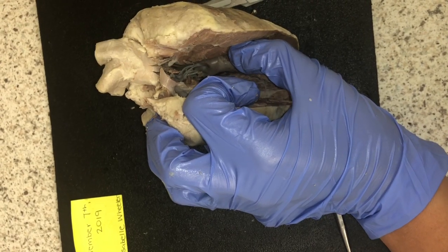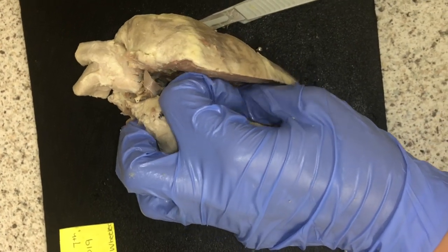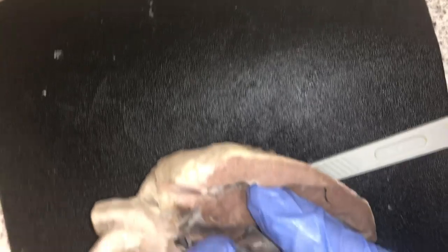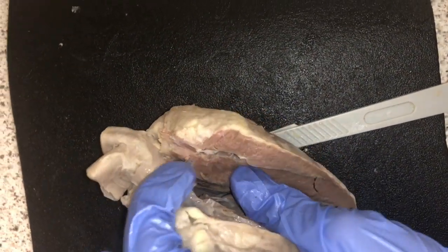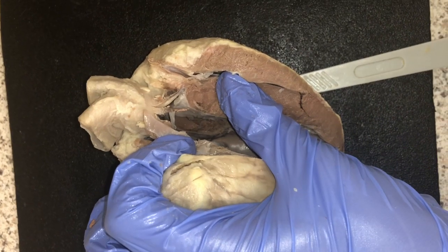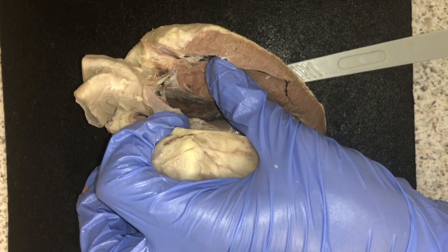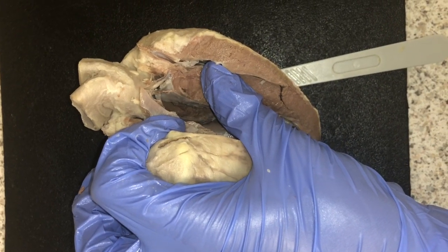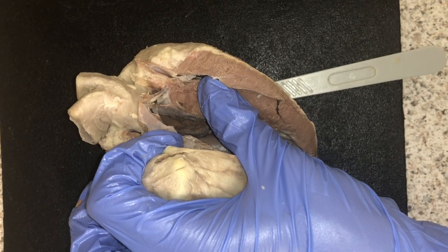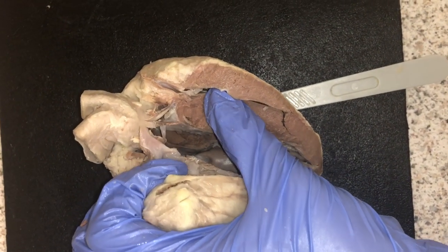Here is the internal anatomy of the left side of the sheep's heart. So I cut into the left side of the heart to see the left atrium. So the left atrium is located right here, right there. The left atrium is one of the 4 chambers of the heart located on the left posterior side. Its primary roles are to act as a holding chamber for the blood returning from the lungs and act as a pump to transport blood to the other areas of the heart.